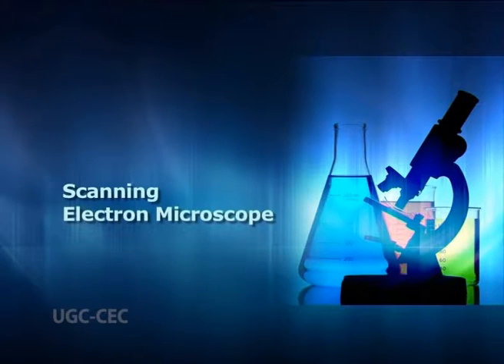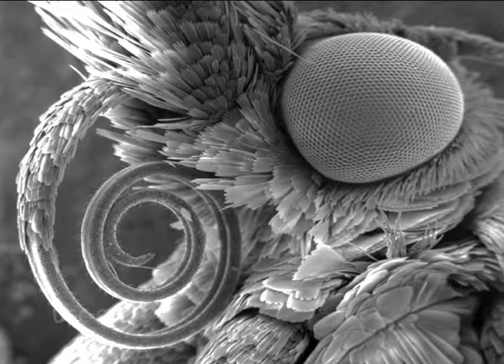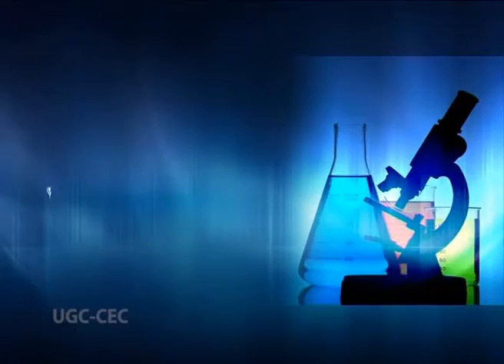Scanning electron microscope. The scanning electron microscope is also a type of electron microscope with lower magnification power than a transmission electron microscope. However, this microscope helps in viewing three-dimensional images of microorganisms and other specimens. Gold and palladium are used to coat the surface of the specimens mounted on a scanning electron microscope.